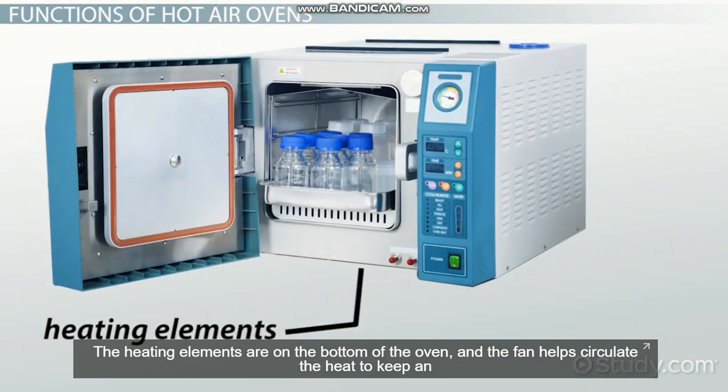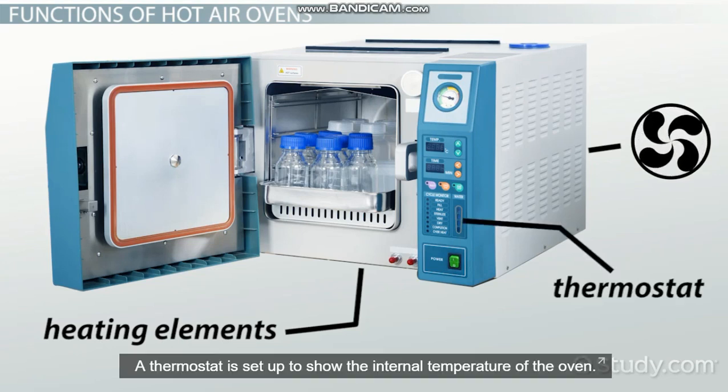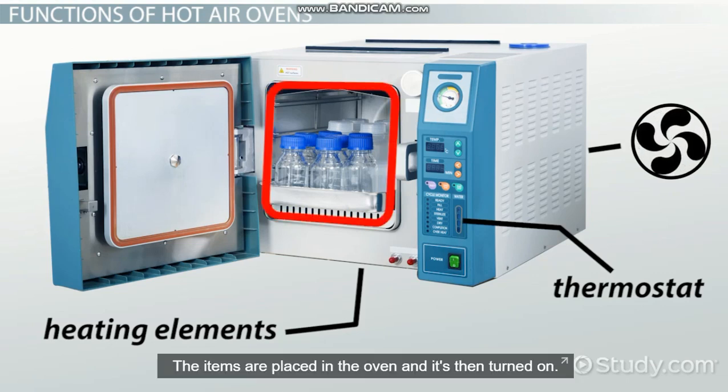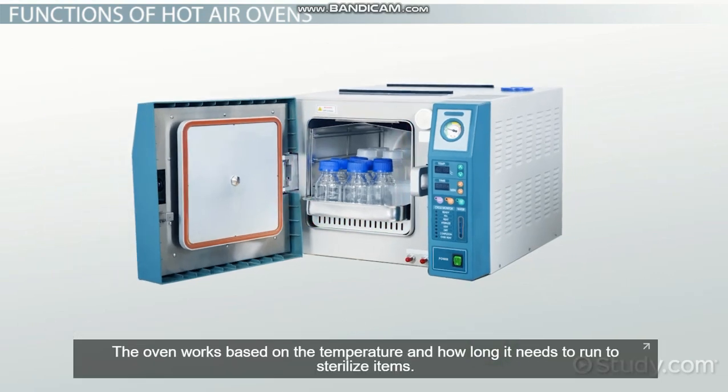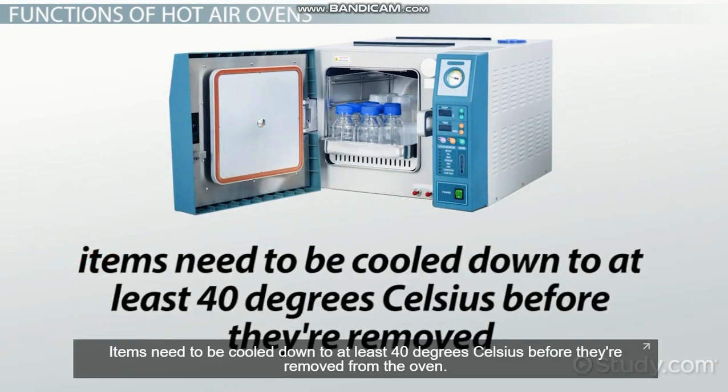The heating elements are on the bottom of the oven, and the fan helps circulate the heat to keep an even temperature with a forced air hot air oven. A thermostat is set up to show the internal temperature of the oven. The items are placed in the oven, and it's then turned on. The oven works based on the temperature and how long it needs to run to sterilize items. Items need to be cooled down to at least 40 degrees Celsius before they're removed from the oven.